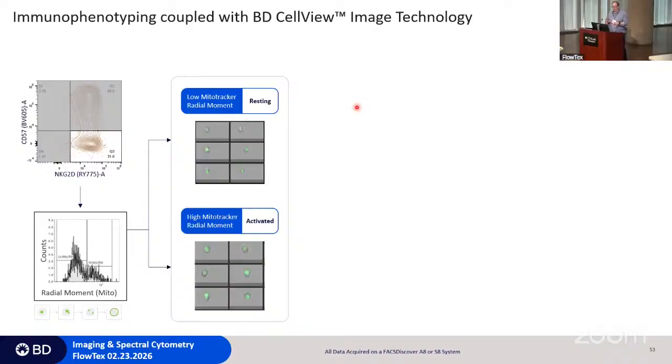So this is what the MitoTracker actually looks like. You can see the ones on the top have that really small green MitoTracker footprint, whereas the ones on the bottom have this more robust one, and that corresponds to the energetic demands of activation. As these cells begin to proliferate, their energetic demands go up, their mitochondrial footprint goes up quite a bit, and you can clearly see it. And that's the other part about the plate-bound activation I really like: if you use Dynabeads, everything just goes nuts.